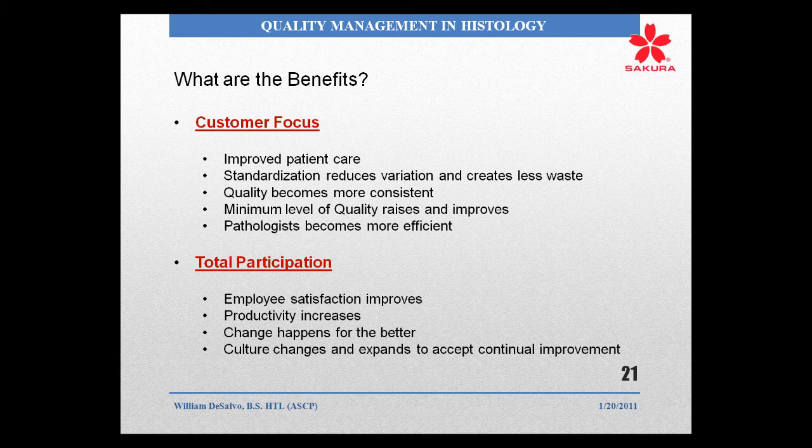So from the basic application of calculations all the way up through these big, large black box measurements that we have, such as digital pathology and quality management flow software, they will lead you to understand, just as quality management systems will lead you to understand, that paper notebooks and paper lists are becoming increasingly obsolete. We don't want to be part of that obsolescence, but the whole part of that was that just doing the science is not enough anymore. Let's move on to total participation.